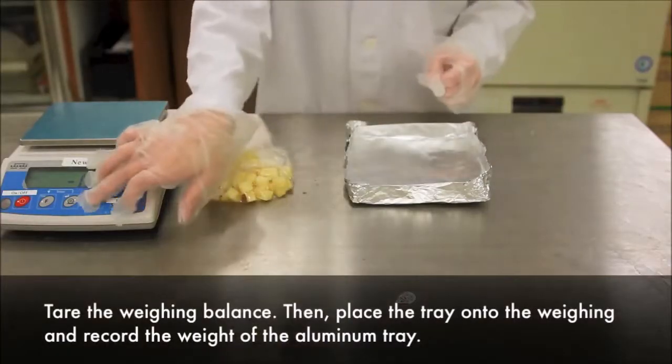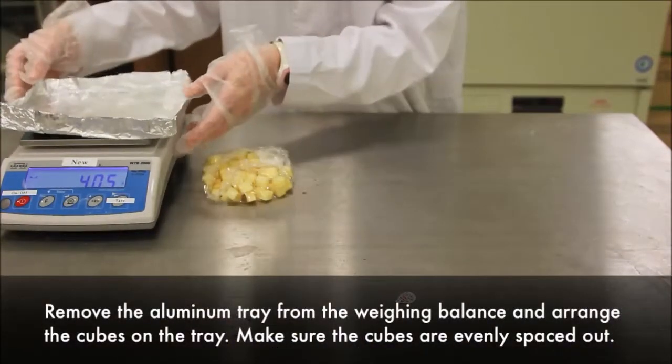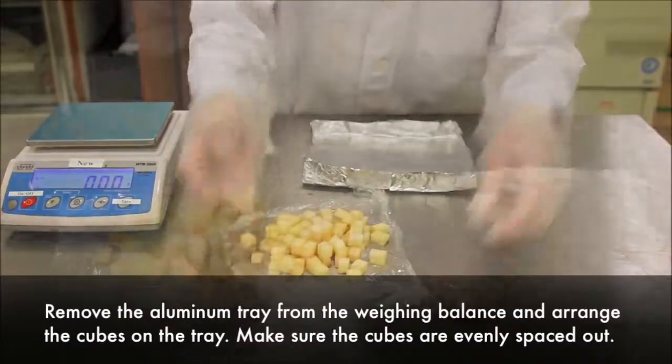Tare the weighing balance. Then, place the tray onto the weighing balance and record the weight of the aluminum tray. Remove the aluminum tray from the weighing balance and arrange the cubes on the tray. Make sure the cubes are evenly spaced out.